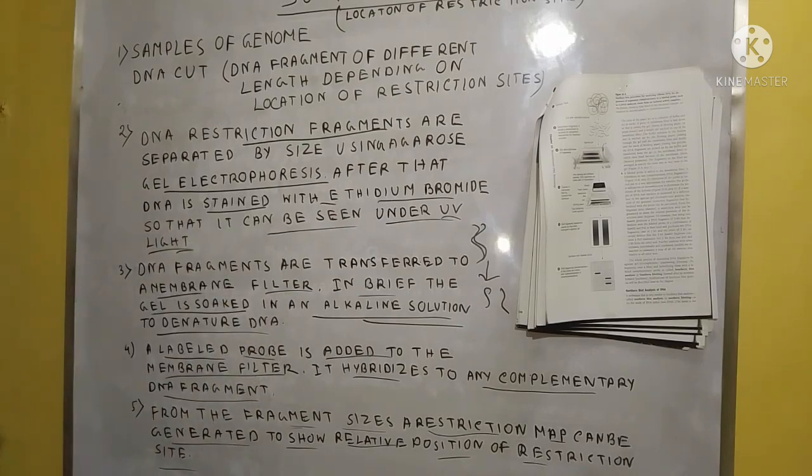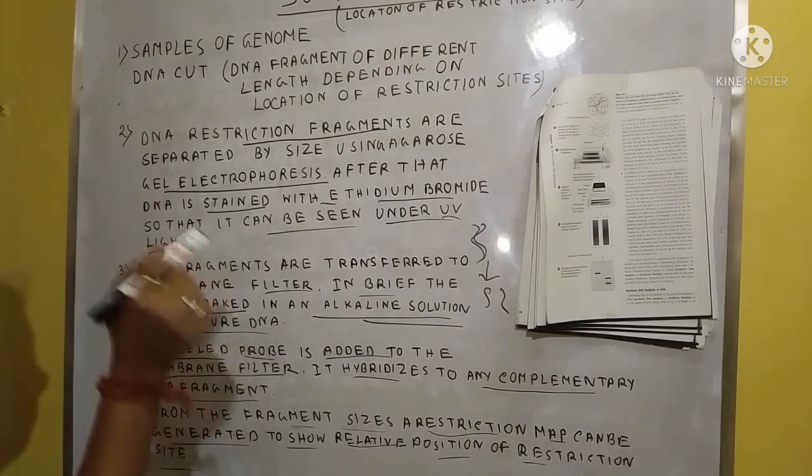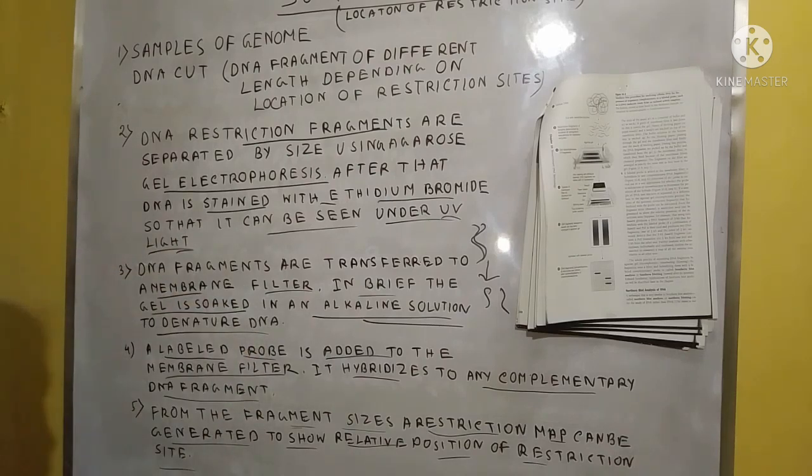And what happens there? The DNA fragments already present within the membrane filter that are complementary to this labeled probe hybridize with the probe. Now we can easily recognize the map or sizes, the restriction map, of the DNA fragments. So this is the process of the Southern blot method.